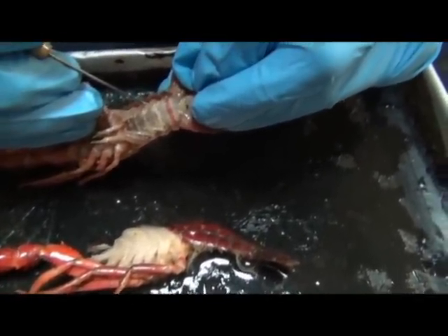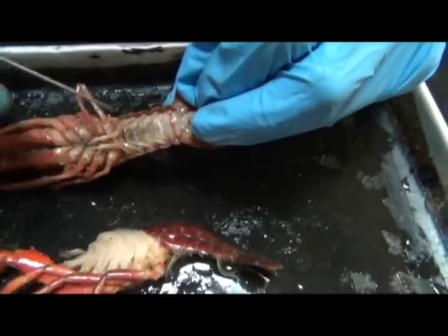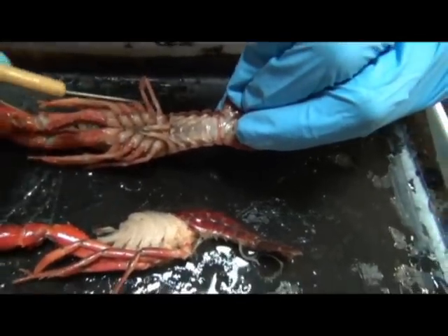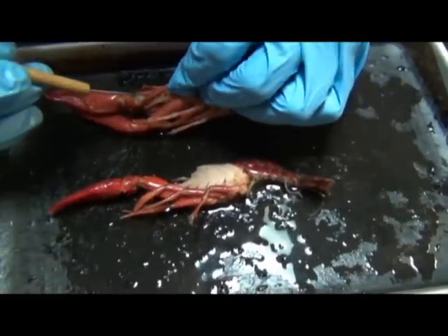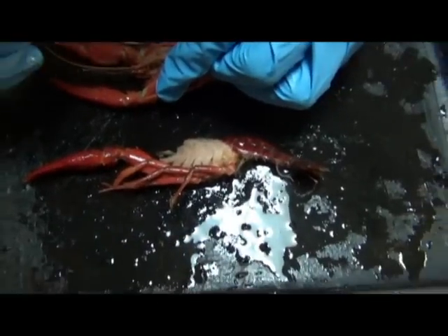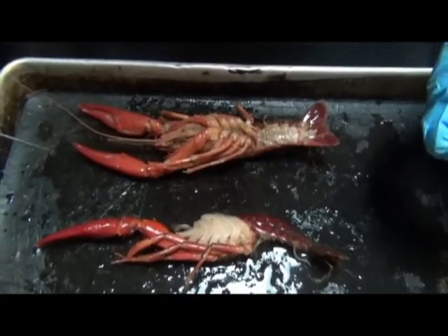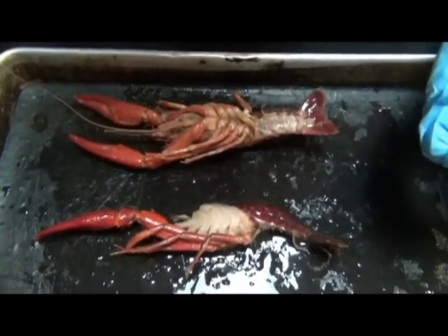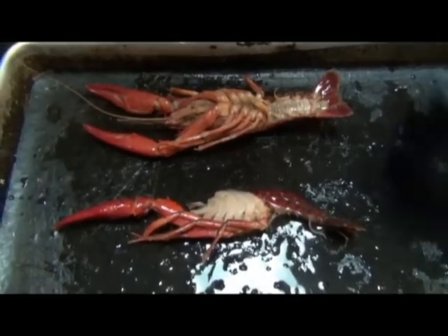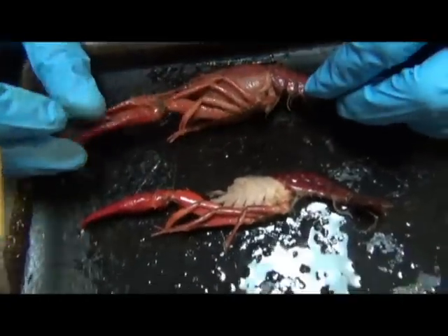Okay, so you can see that there. So, from the swimmerets to the walking legs, and also if you actually were to look at the mouth parts or even the antennae, these structures that I highlighted all are biramous, meaning at their base they have two extensions coming out, two branches, and that really typifies this group, the Crustacea.